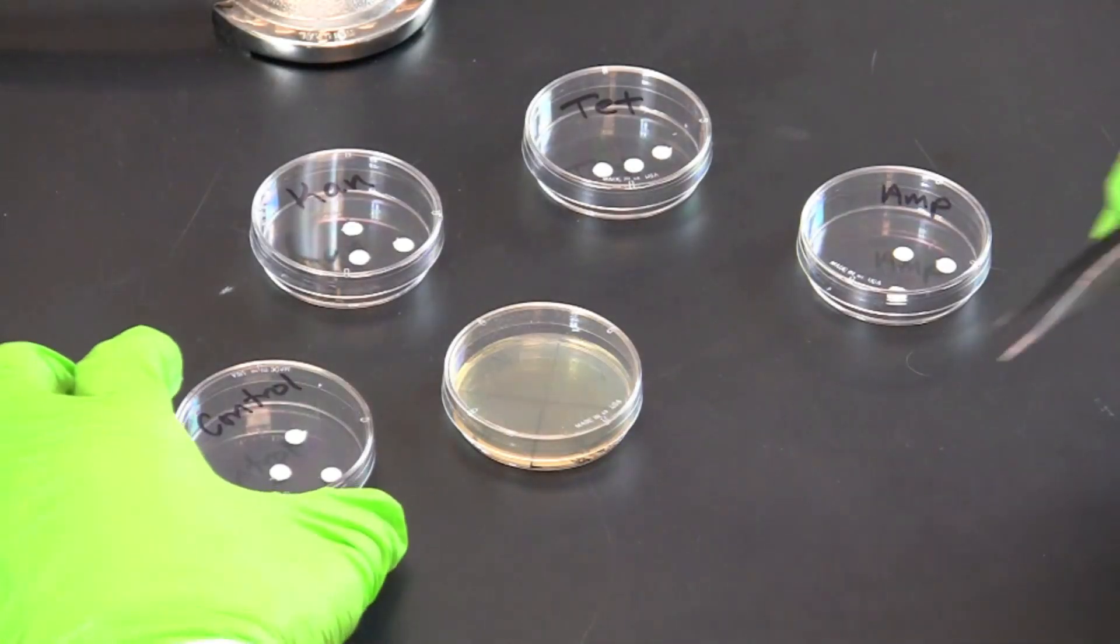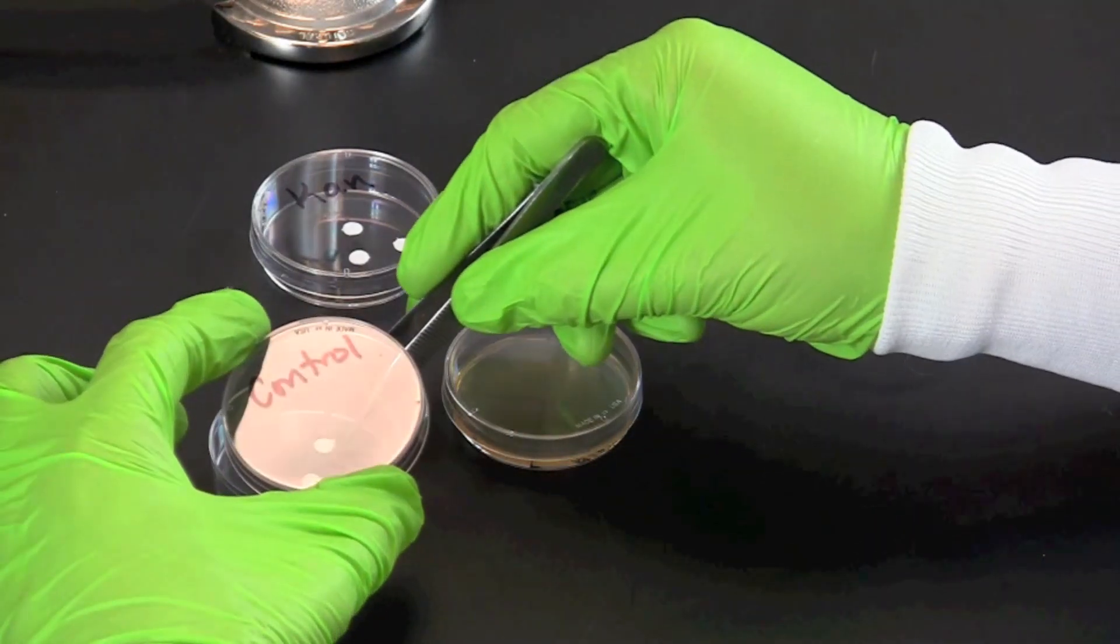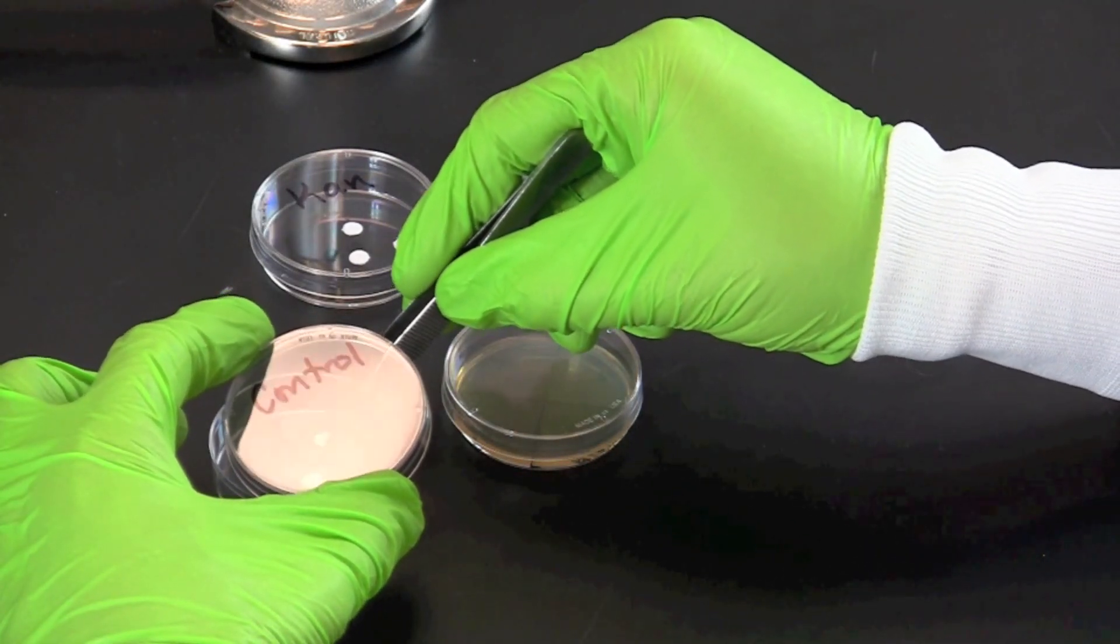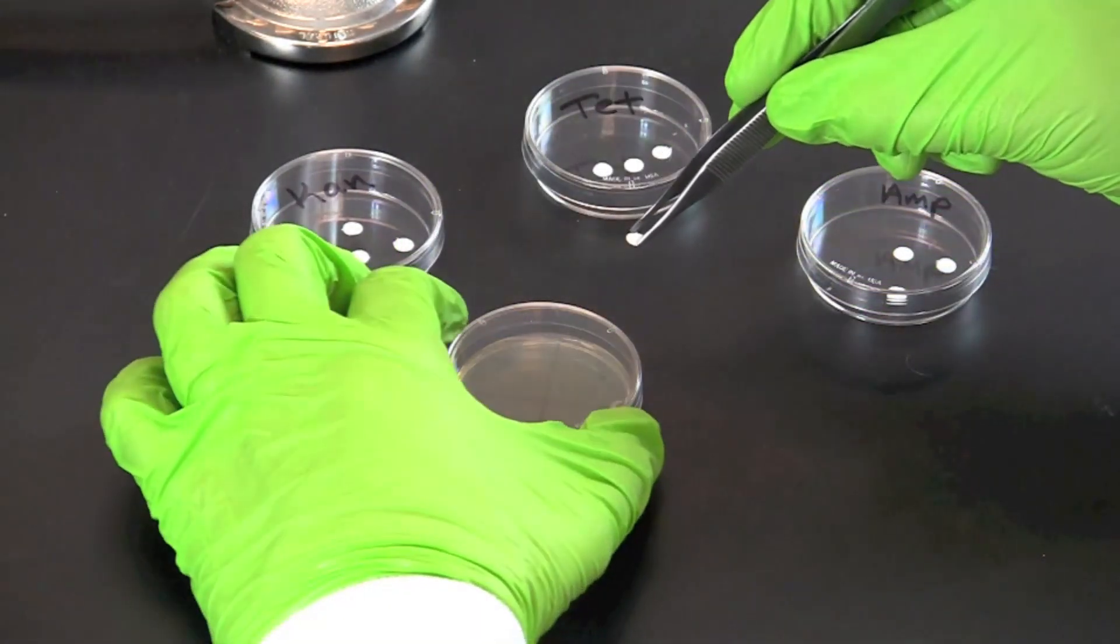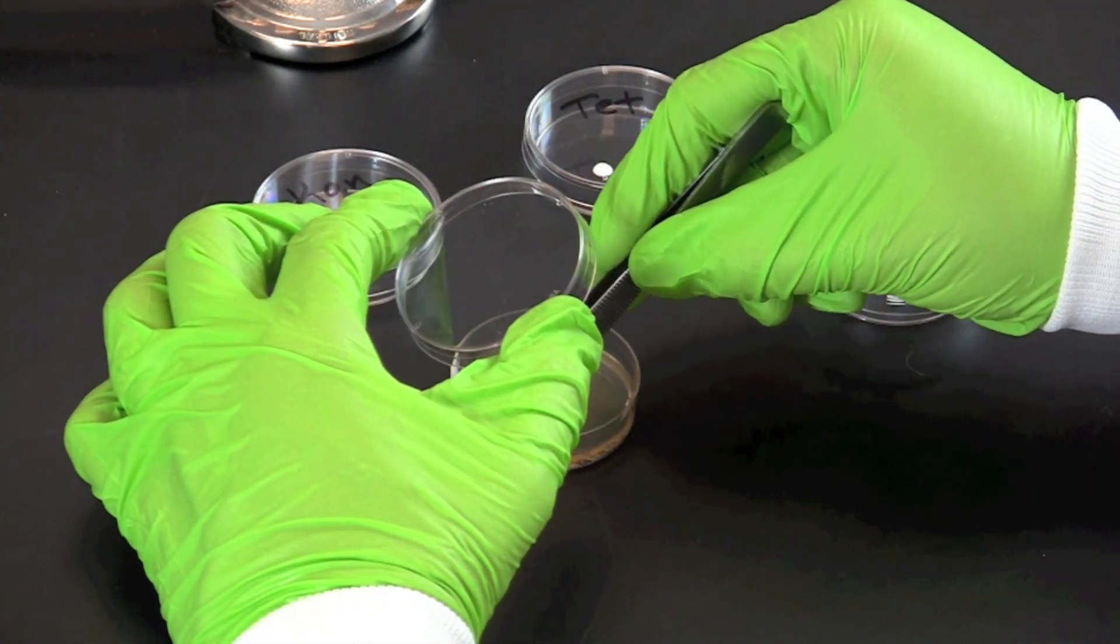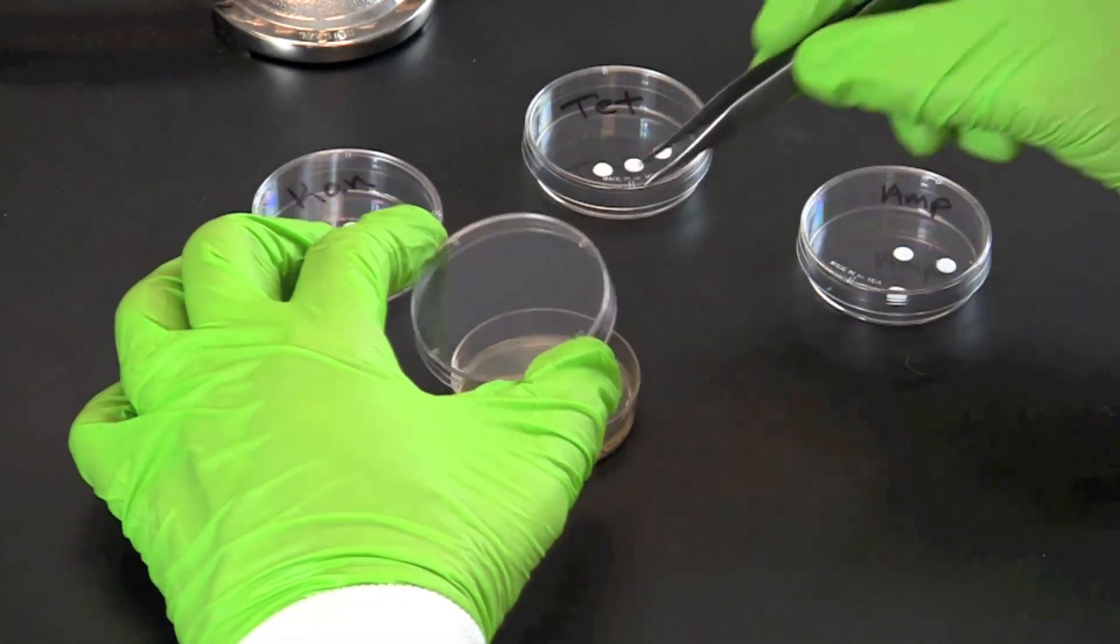Use a sterile pair of forceps to transfer a control disc with no antibiotics to the center of the correct quadrant. Gently press the disc with the forceps to ensure that the disc makes contact with the agar.